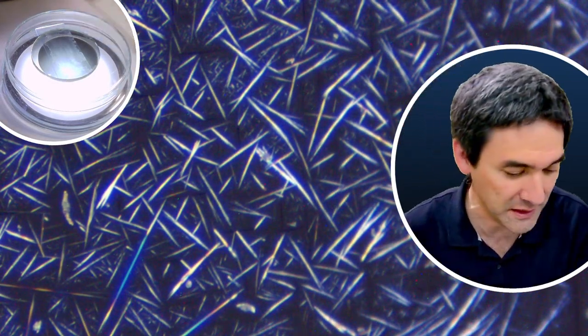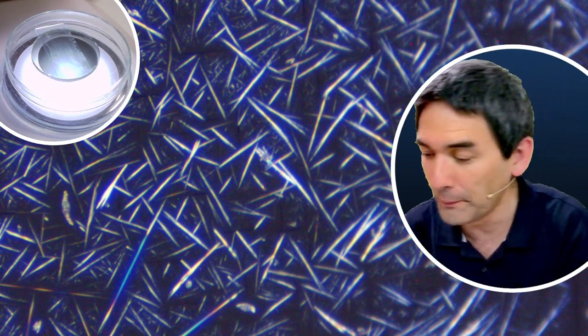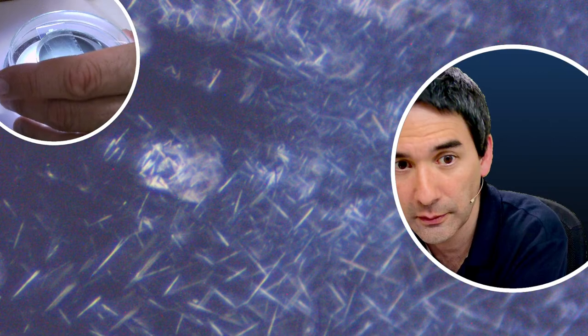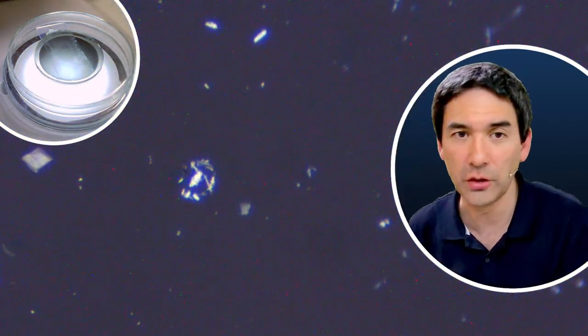Okay, quite easy. I'm going to take a little bit of the alcohol solution, and I'm going to now drop it directly on the slide. Okay, so it's going to dissolve now. You see, it's dissolving.